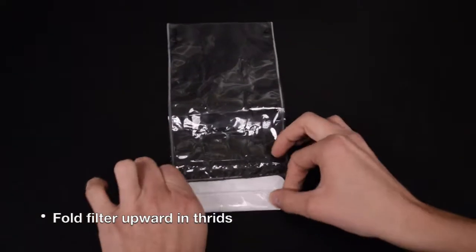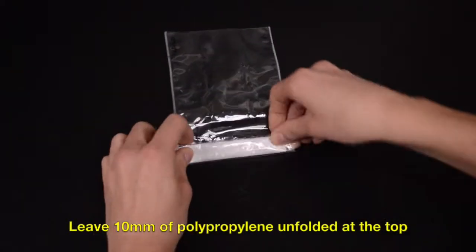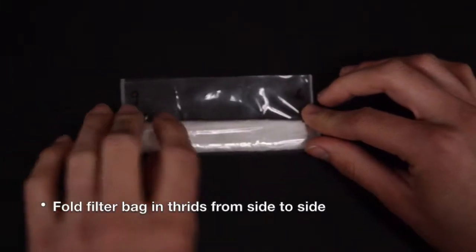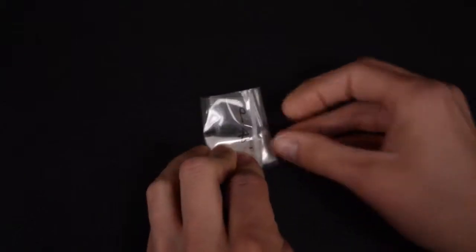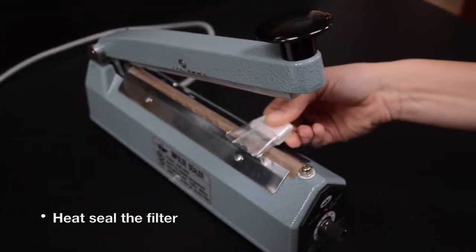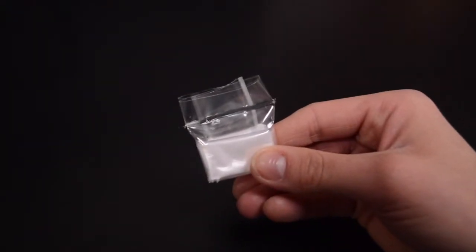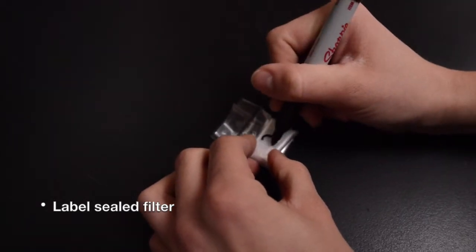Starting at the bottom of the bag, fold the filter upward in thirds and continue to fold upward, leaving at least 10 millimeters at the top of the clear polypropylene that is not folded. Fold the bag in thirds from side to side. With your heat sealer set to 6, place the exposed polypropylene material from your final fold onto the heat sealer. Press the arm of the heat sealer down. Release the arm three to four seconds after the red light goes off. Re-seal the bag if necessary. Label the folded sealed filter bag and place it in a pre-weighed ashing crucible.